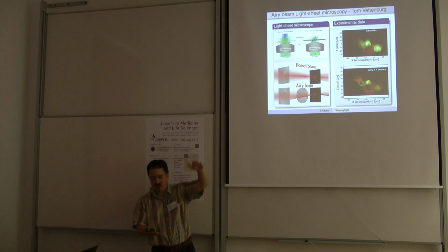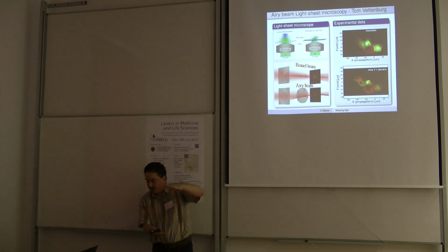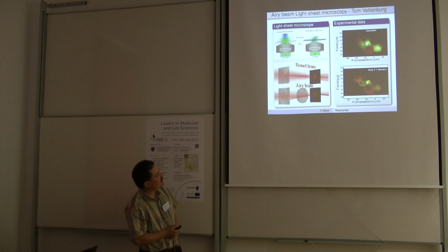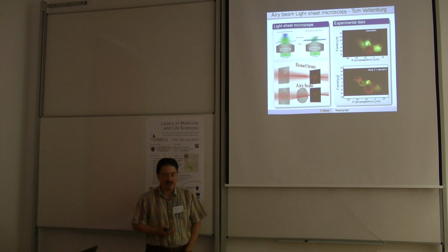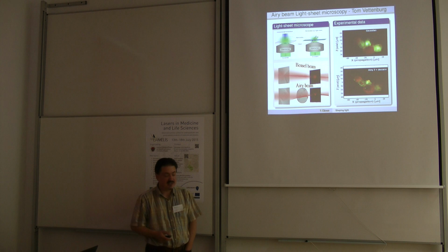And then if you move the plane up and down, you basically scan all the 3D volume, and you can reconstruct quite nicely the 3D distribution of the sample. And I think it was named Method of the Year last year. So people fight and compete in generating better and better light sheets now, right? And better methods to implement the light sheet as well as possible, using two-photon microscopy, using structured illumination and other things.